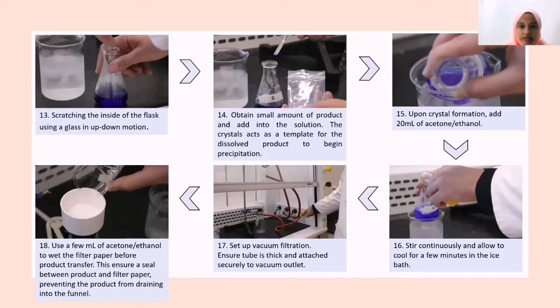Upon crystal formation in the flask, we must add 20 ml of acetone or ethanol. Make sure to stir the solution continuously and allow it to cool for a few minutes in the ice bath.